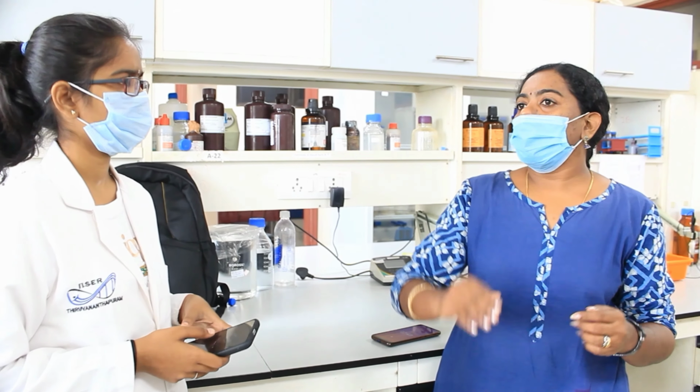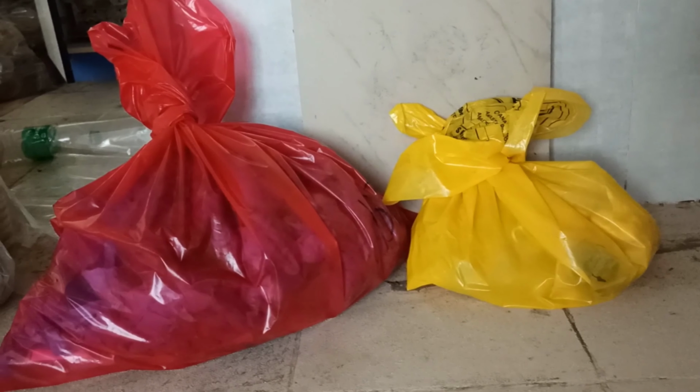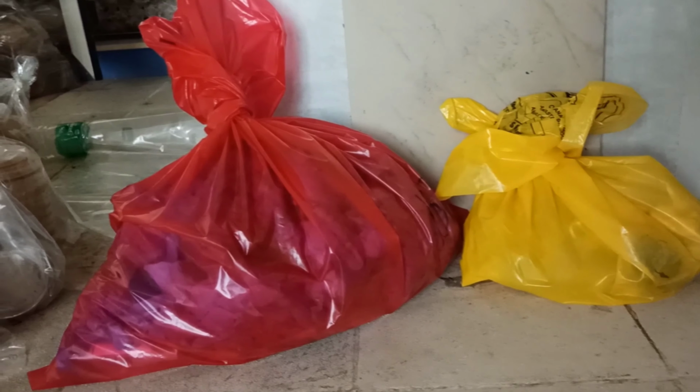Ma'am, so will they check? They will also check. So we usually check, and they will also check once again, and only then take it. The primary sorting of bio-waste is handled by the housekeeping staff of our institute. Hear from them.